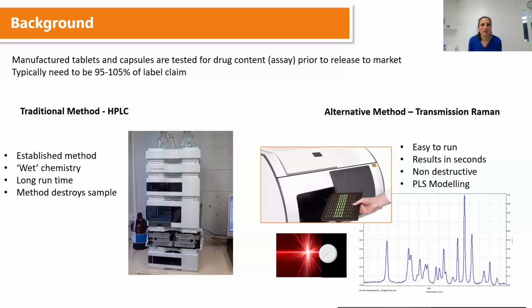I work for a generics pharmaceutics company, and we make a range of tablets and capsules, about 150 different prescription medicines. So for those of you that aren't in the pharmaceutics companies, what you may or may not know is that when we make a batch of tablets, we obviously need to test them before we can release them to market. And we have to do a range of tests of kind of checking that it is the drug that we're saying it is, it's got the correct amount of drug in the tablets, and there's no impurities that are going to cause reaction in these tablets.